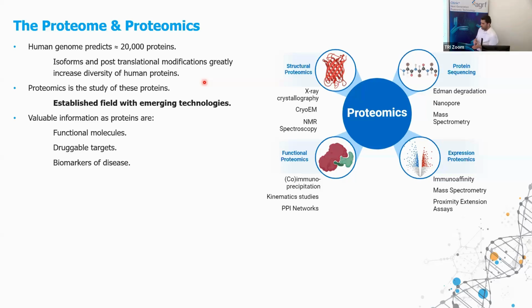It's an established field. It has quite an interesting history here in Australia, particularly, but also has a number of these emerging technologies. I've given a brief rundown of some of the existing technologies within proteomics, with specific reference to the types of information that they can provide. For instance, proteins being these really diverse three-dimensional structures, it's terrific to understand those structures themselves. And you do that through structural proteomics with things like X-ray crystallography.